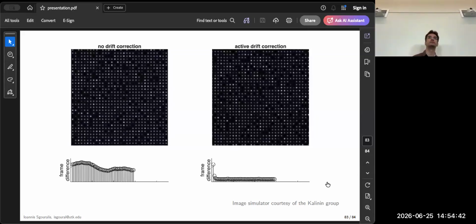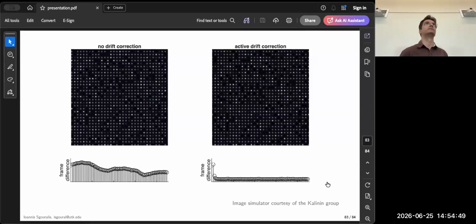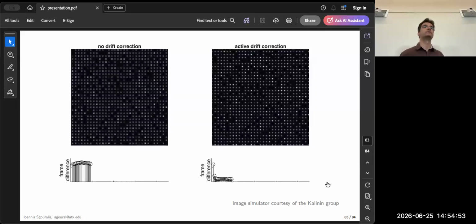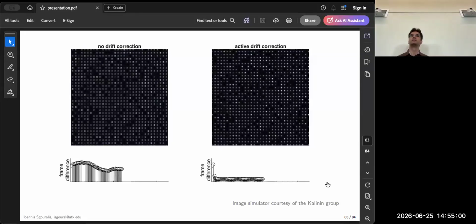To piggyback off of that, it's really interesting because I want to hold samples as still as possible so that I can maybe blast a certain spot or something. Then that changes the image. So how would you take that into account in the method, that the image might be changing frame to frame, even if just locally or something?